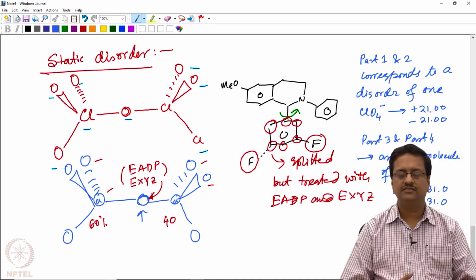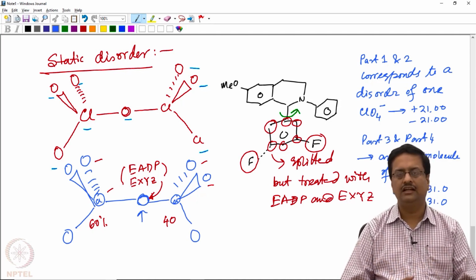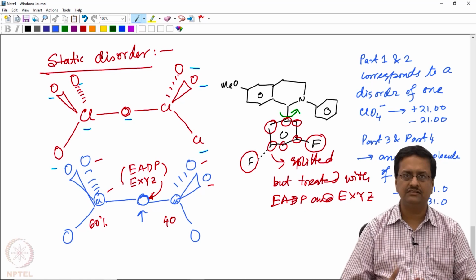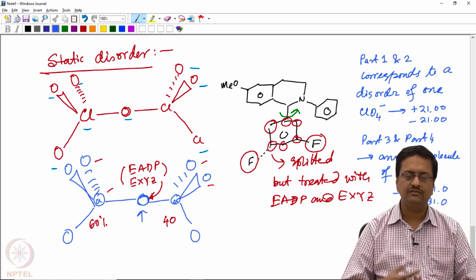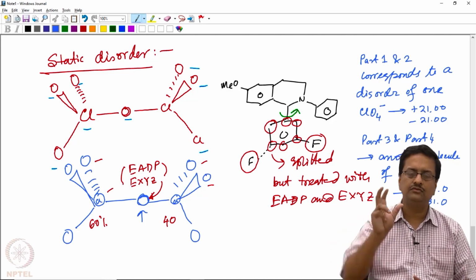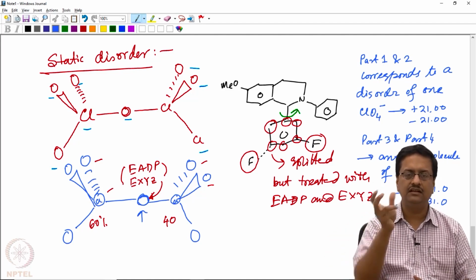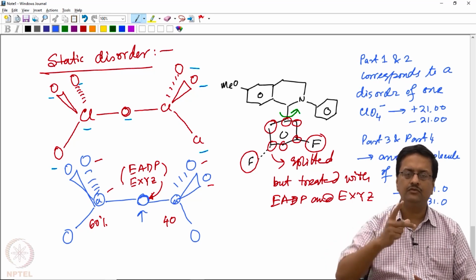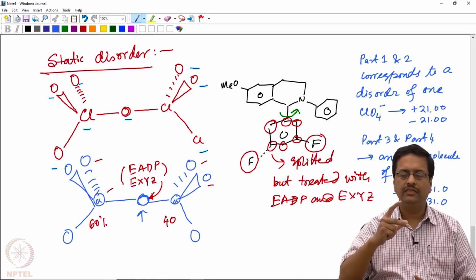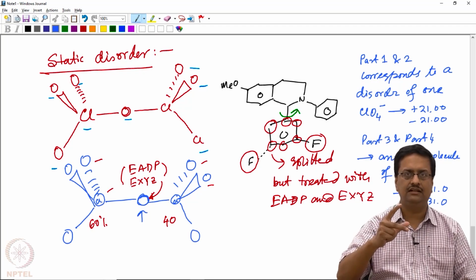To avoid such a situation, we always recommend that you take a crystal at room temperature and slowly cool the crystal to 100 K so that you allow all the molecules to slowly reduce their temperature and refine their thermal vibrations, and then come to a thermal minimum and then fix at one place at 100 K.